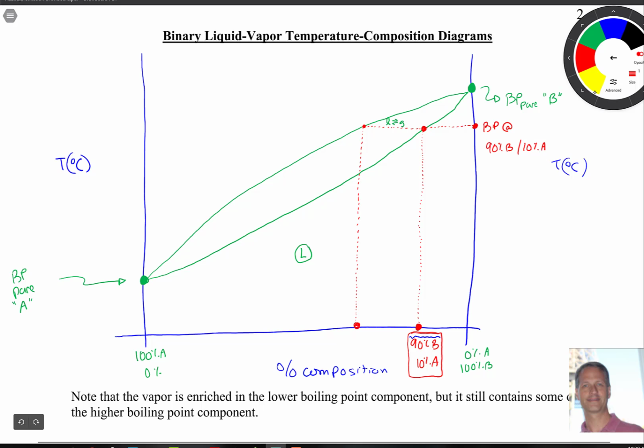So that's what we collect. Down here, this is important to point out. Here's what we collect. If that's our 50 point, we might call this, what, 70% B, 30% A. Something like that. We're just making a guess there.